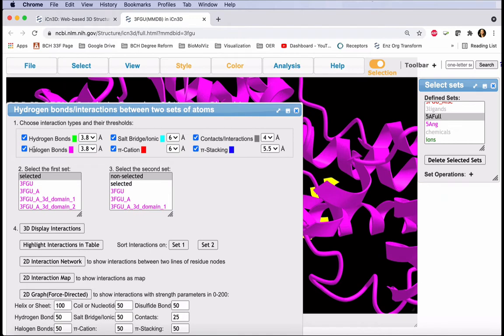This list comes up and shows comprehensive interactions. We only need a few of these, Hydrogen Bonds and Salt Bridges. For our first set, we'll select our ligands, and for our second set, we'll select the five angstrom active site.